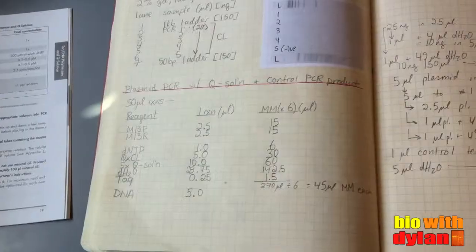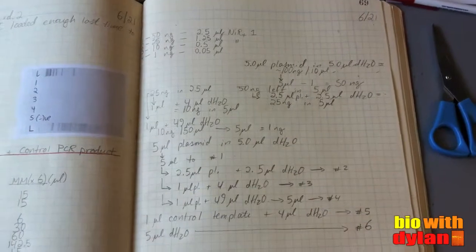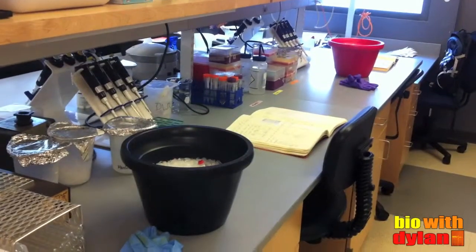I'm gonna run another PCR with a positive control and this mysterious reagent called Q-solution, which might make my reaction run smoother.